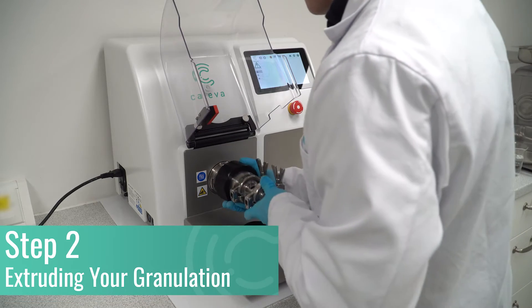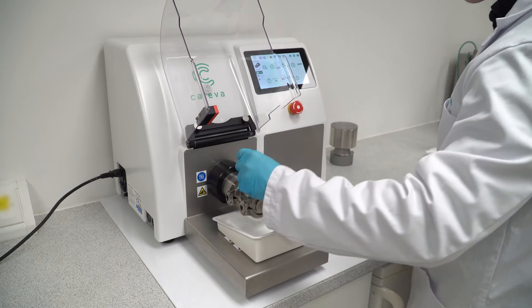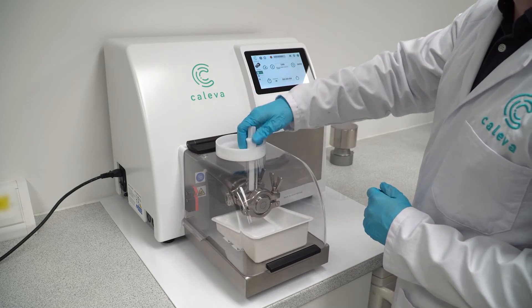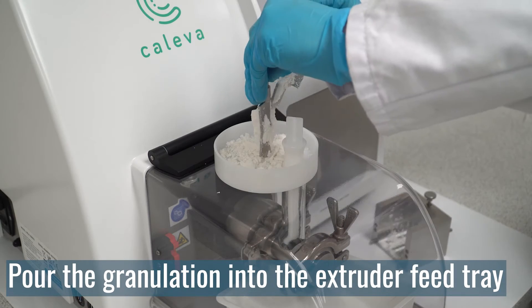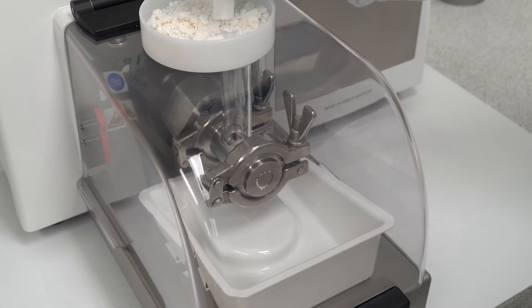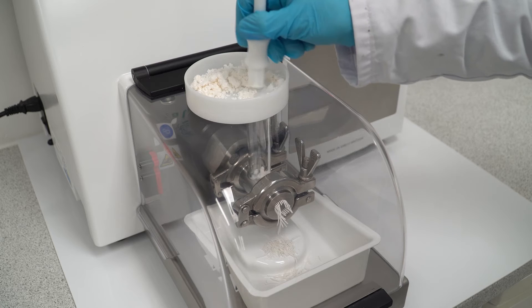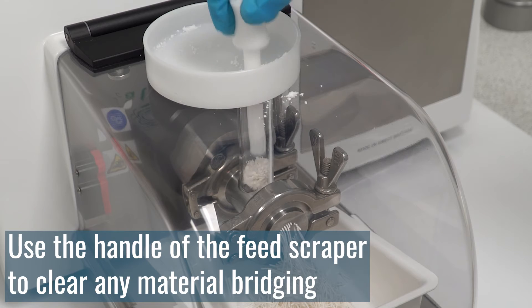Fitting each attachment takes a matter of seconds, allowing operators to turn powder into pellets in as little as 15 minutes. Pour the granulation from the mixer bowl into the extruder feed tray. Slowly feed the running extruder. If material bridging blocks the feed tube, turn the feed scraper over and use the handle to push the remaining material into the extrusion screw.